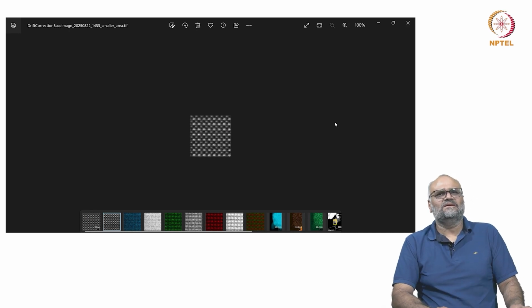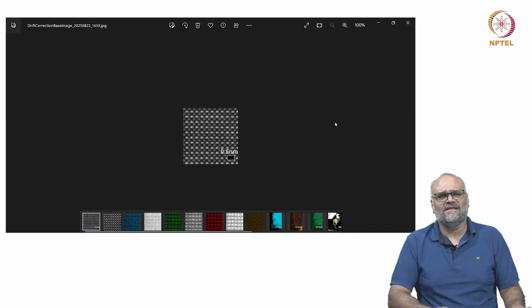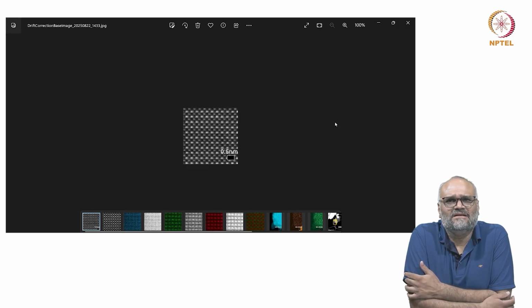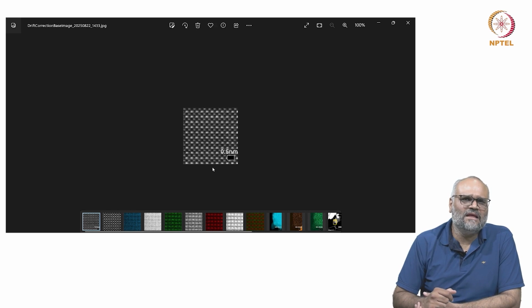So here is another example of the image without the scale bar, and here is the image with the scale bar. So you get the data exported in different forms. This is how the STEM data typically looks, and quite often we just copy and paste these and don't even bother to change the scale bars and make them uniform and presentable.